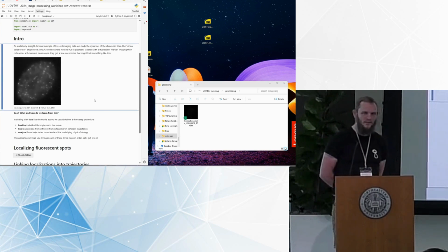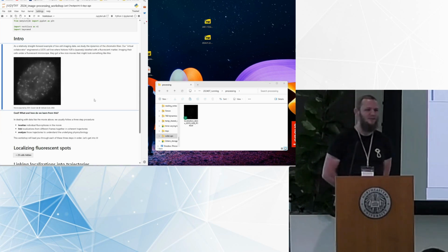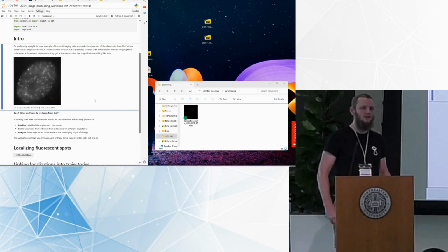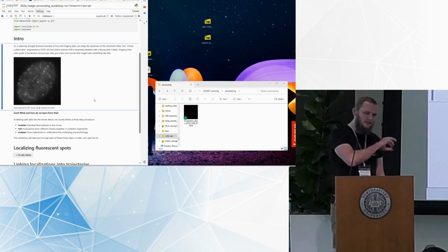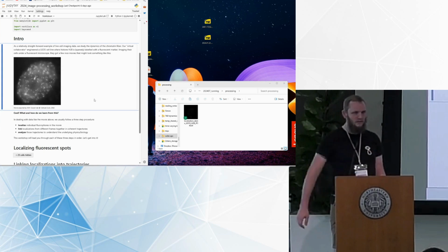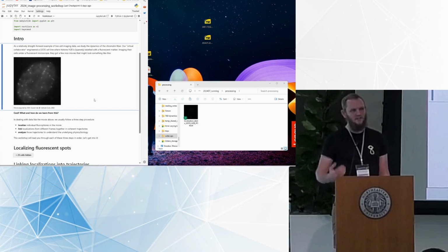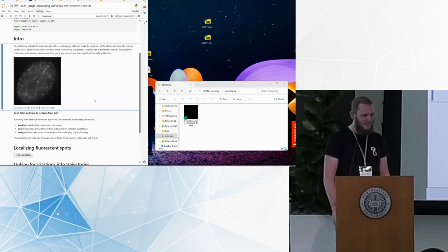That's an example movie that I recorded myself at Institut Curie in the lab of Antoine Coulon. And what you can see here is a single molecule dye attached to histones. So what we're doing is we're tracking histones in a U2OS nucleus. And the idea here is to now study the dynamics of genome organization, also genome more broadly, I would guess.